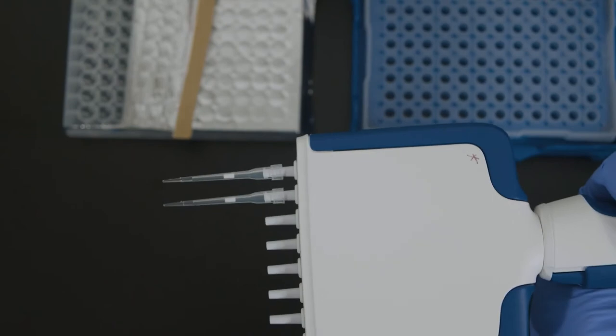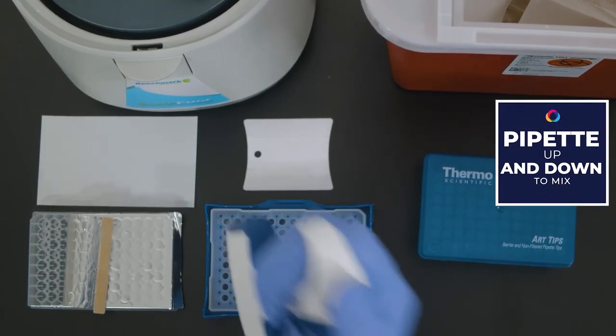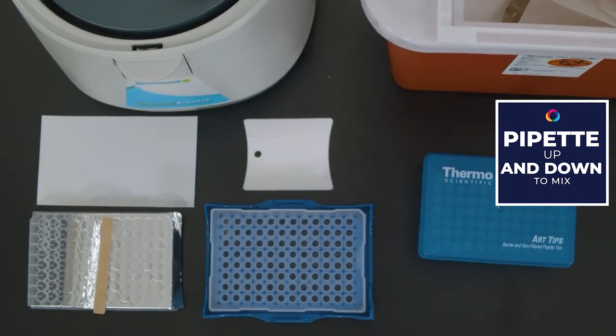Always check tips for full uptake and dispense of the 5 microliter template. Pipette up and down to mix. Be careful to prevent any contamination between wells.